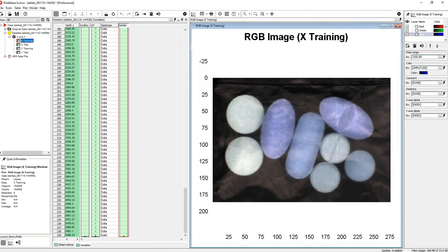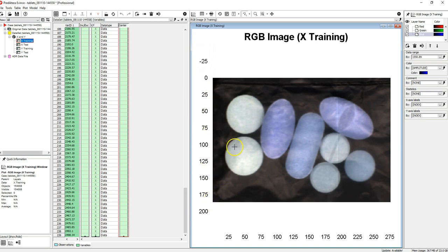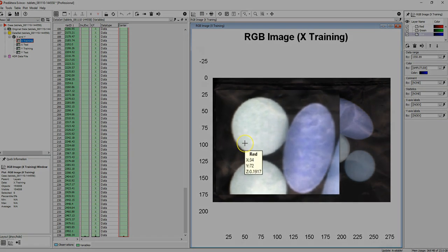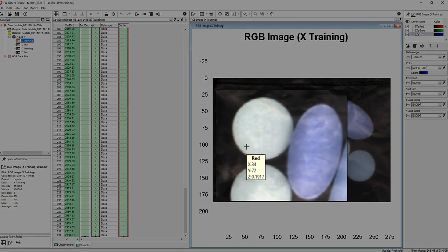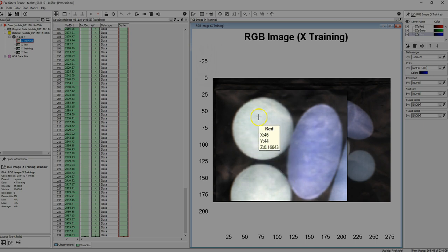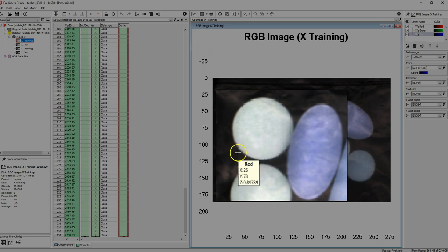The scale for the X and Y axis of your image is in pixels. If you move your mouse around your image you will get a tooltip showing you the pixel coordinates for the X, Y and Z which is the absorbance value.